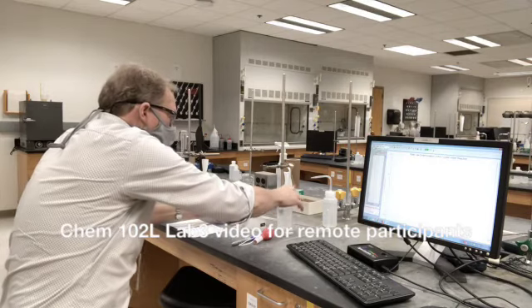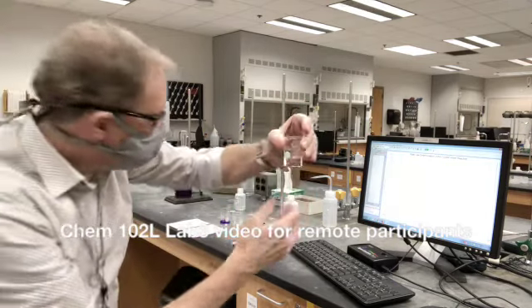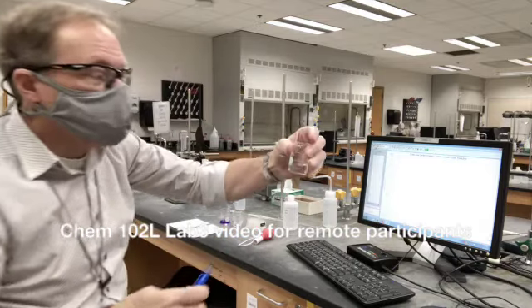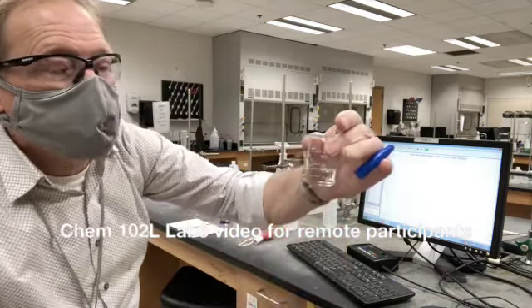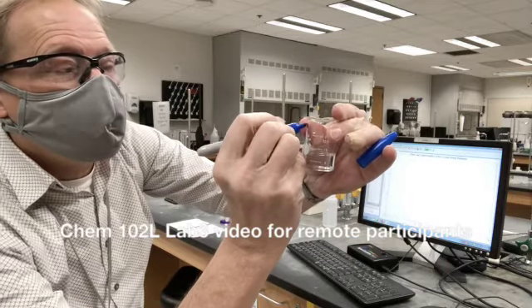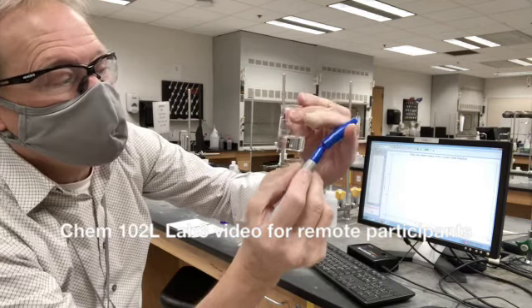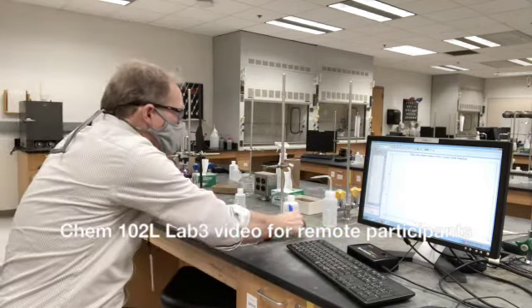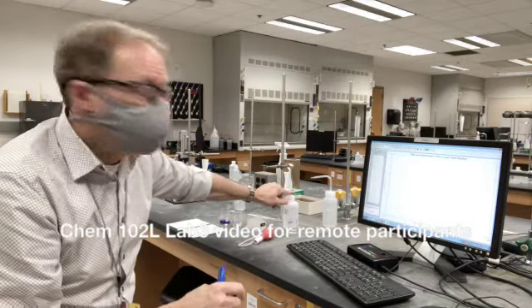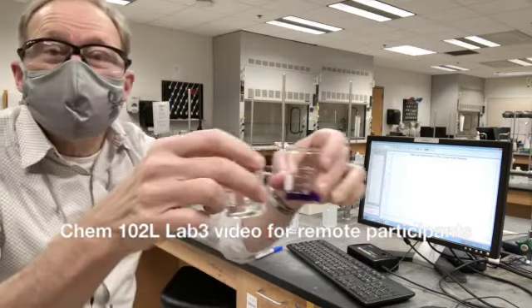This beaker which has the sodium hydroxide in it is going to be confusing because the sodium nitrate you'll use in the second part looks just the same. So I'm going to write NaOH on here in Sharpie, and that can be taken off later with a little acetone. So now that's labeled, and I also set it next to the sodium hydroxide. Now these are our two liquids.